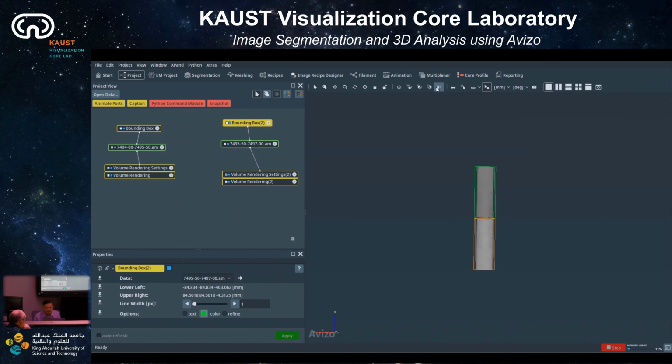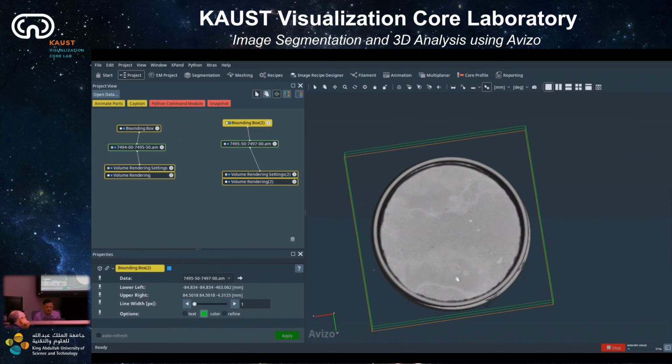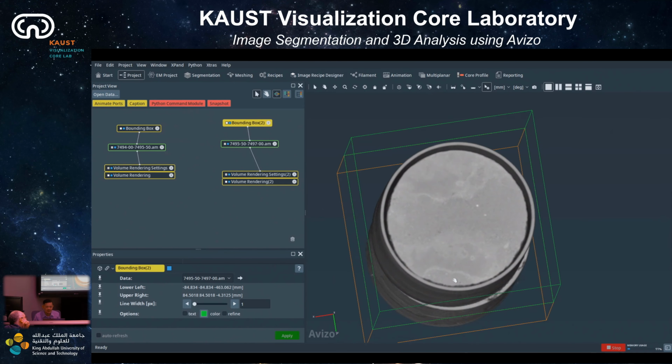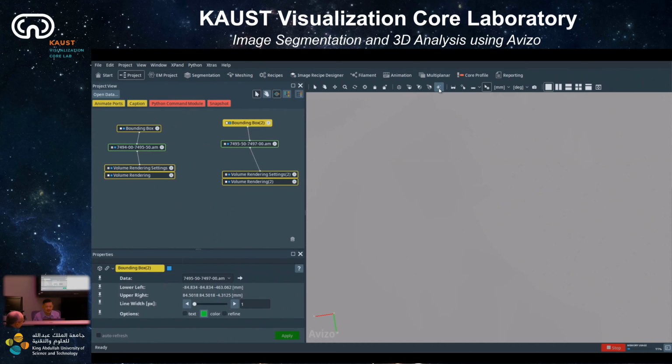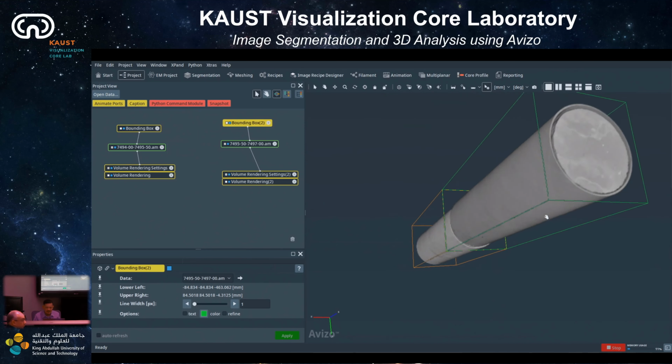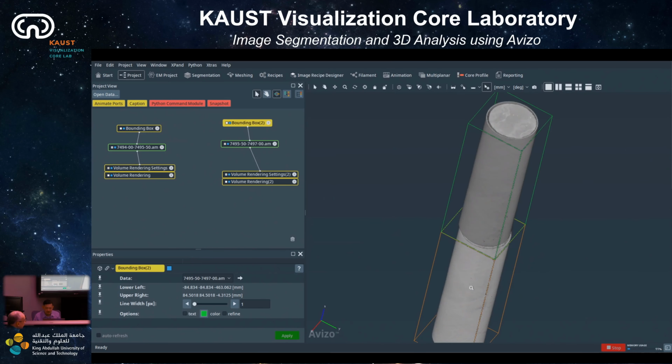So you can see that by default we are on perspective view like this. It's never completely overlapping because it projects perspective. To do any volume edit, you should go to the orthographic view. When you're on the orthographic view like this, you can see that they can completely overlap. It gives you exactly the same dimension. Otherwise, you might not get a good judgment of your data. Instead of seeing the projection like this, if you change to orthographic view, you see the real dimension of the data set.